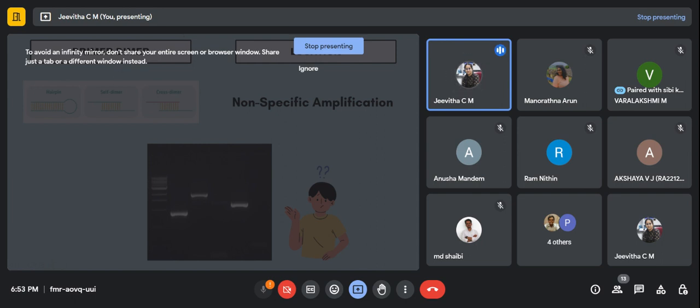What we call a primer dimer is when the primers which you are designing, for example here in this case, we can take this blue one as one primer, the forward primer, and when you give a higher concentration of primer for your template to amplify, in that case, when both primers start to form a bond and start to amplify, that is called a self dimer.